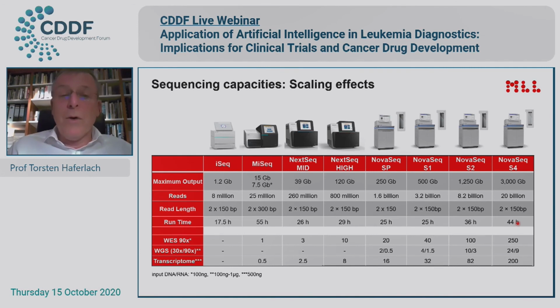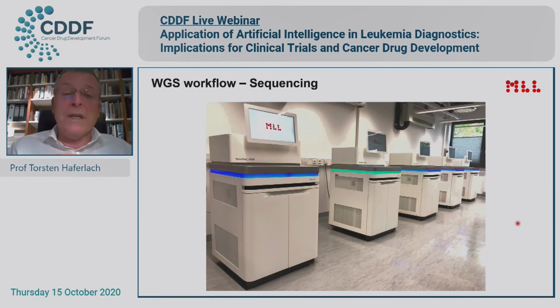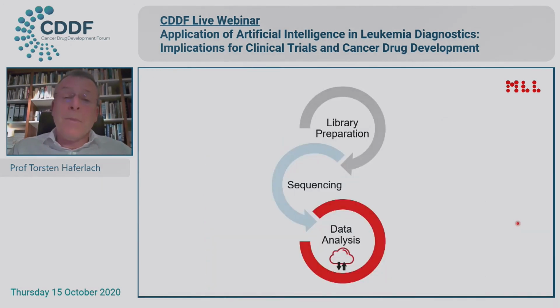And we are doing this now for today in a research setting, but I think it will change in the next years to routine. And these are the machines we use. We have 5 NovaSeqs in our laboratory to run all this research. And I can tell you that they are already now also in the routine. They are used for the panels, and that can be combined in one flow cell. So there's a lot of improvement in the technologies for routine and for research on the same machines. Now, the turnaround time for a genome, as we thought before, would be quite different from a panel sequencing or morphology, but the turnaround time of a genome also changed.